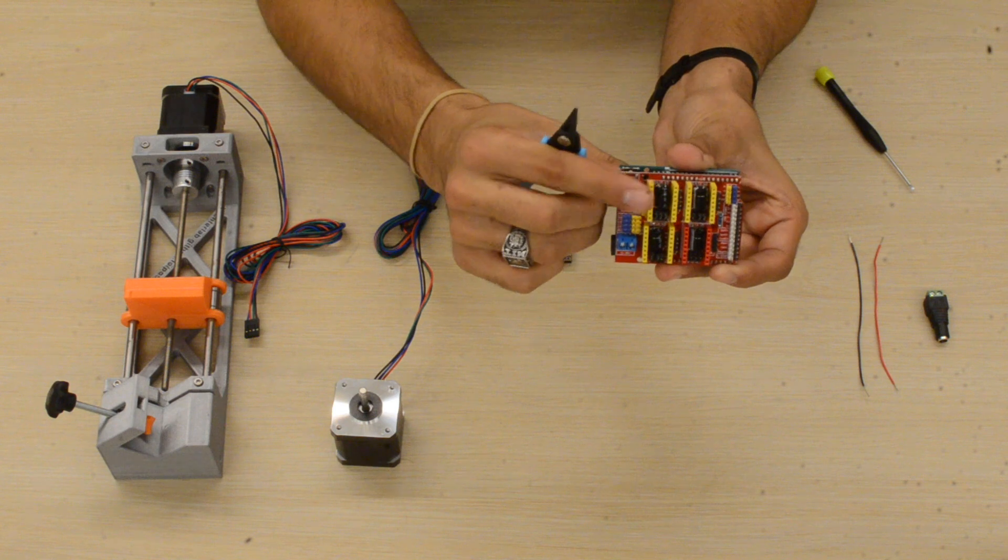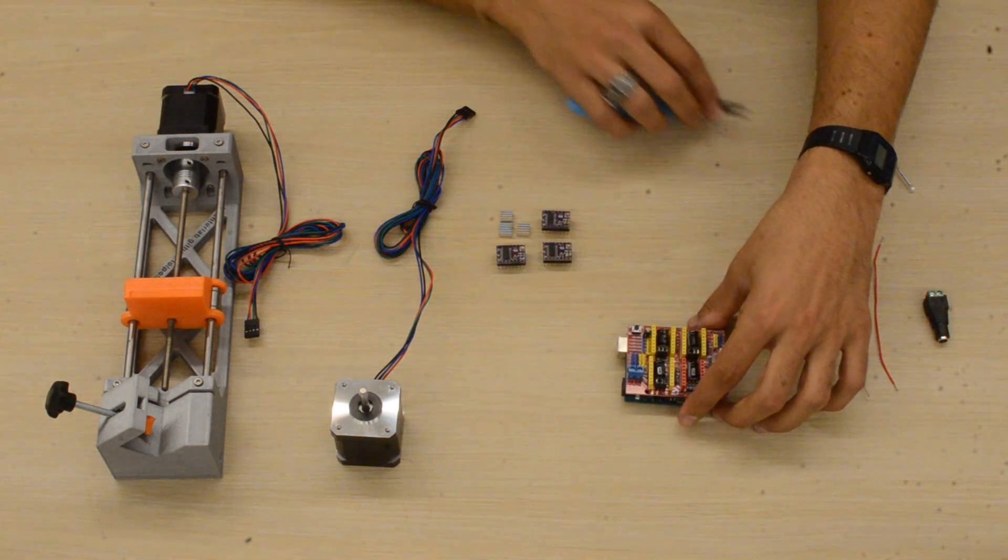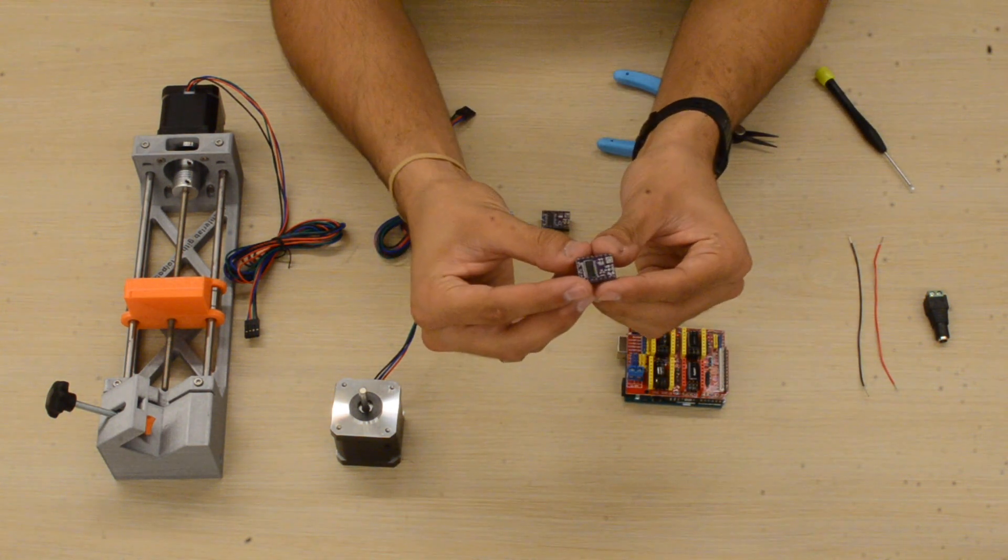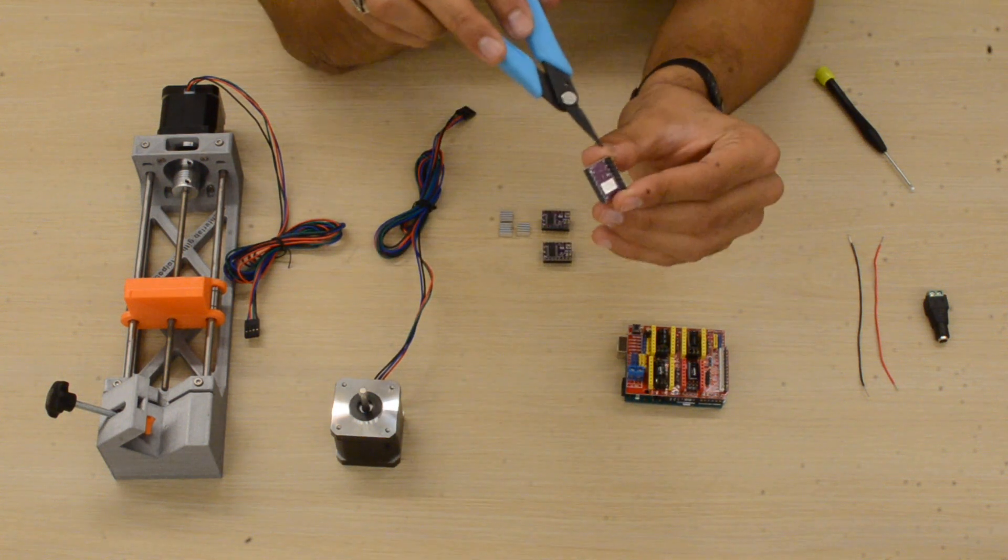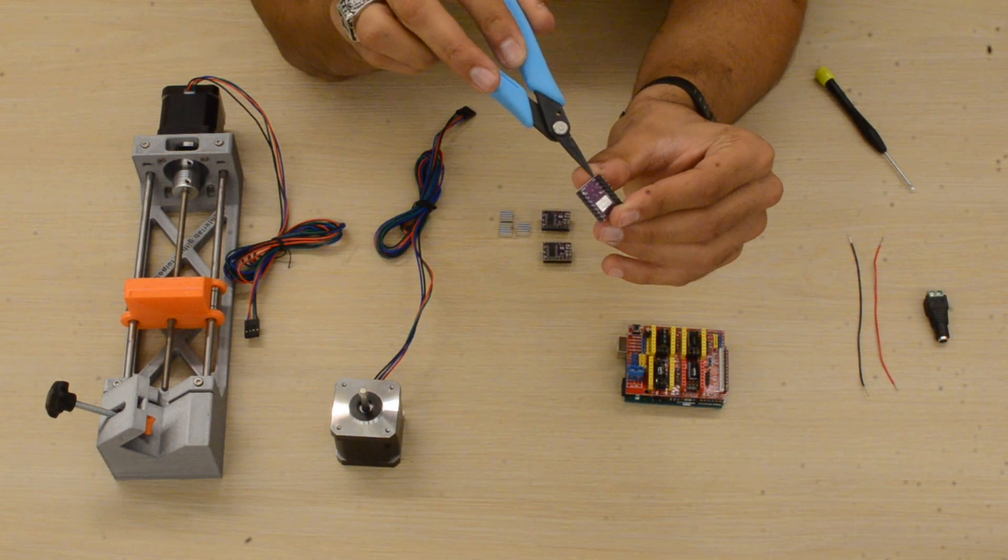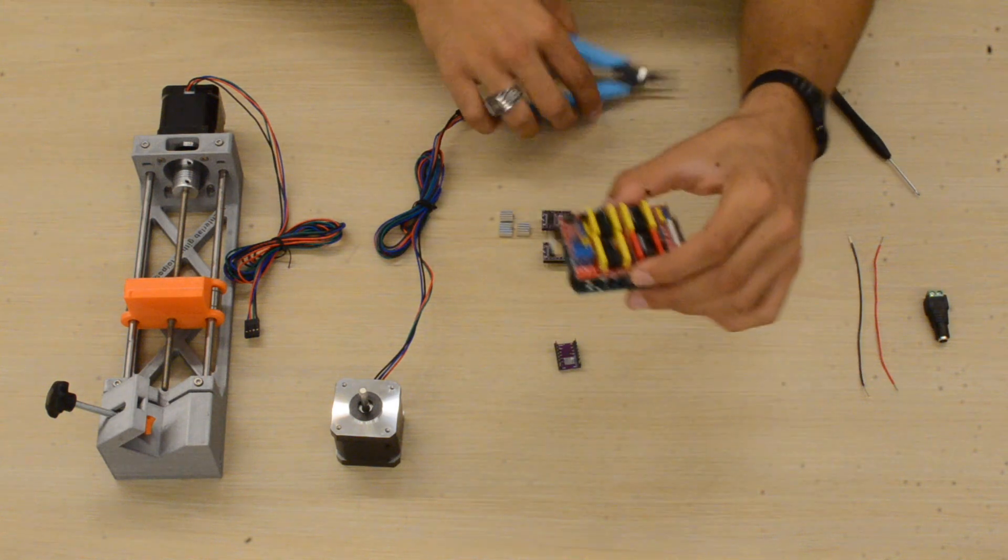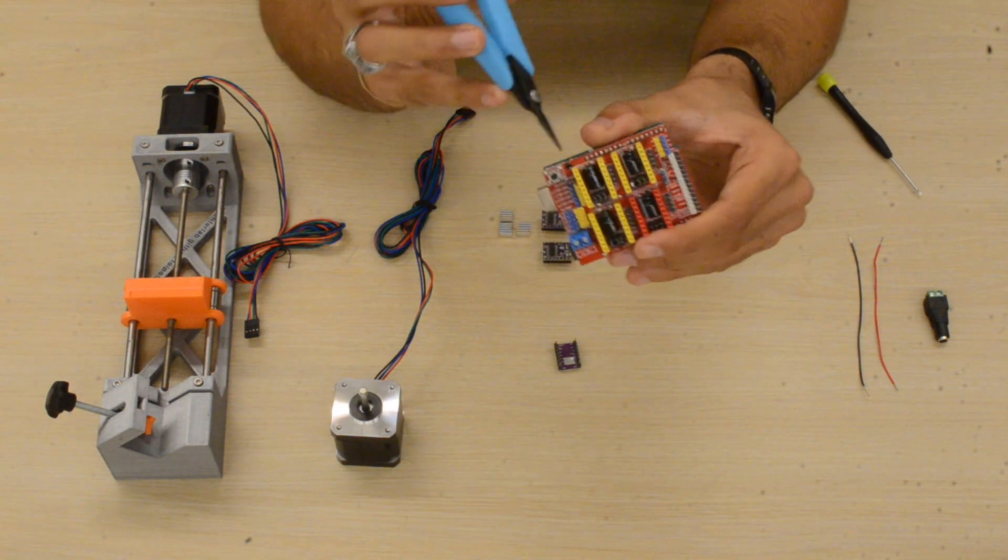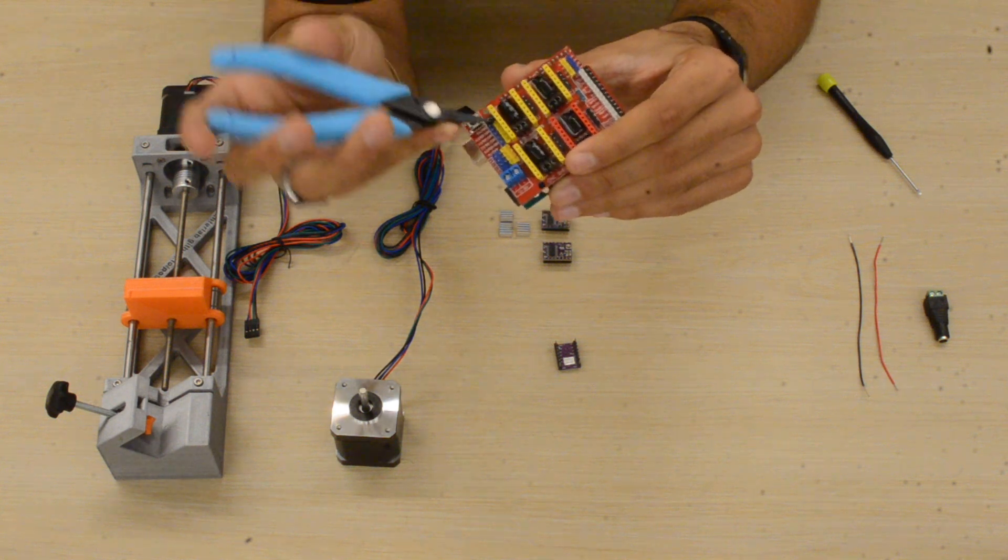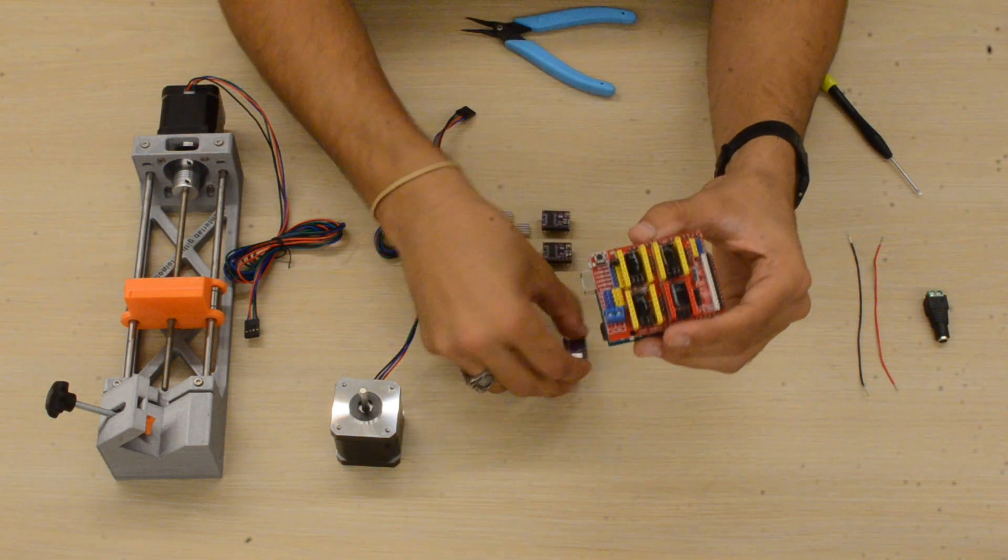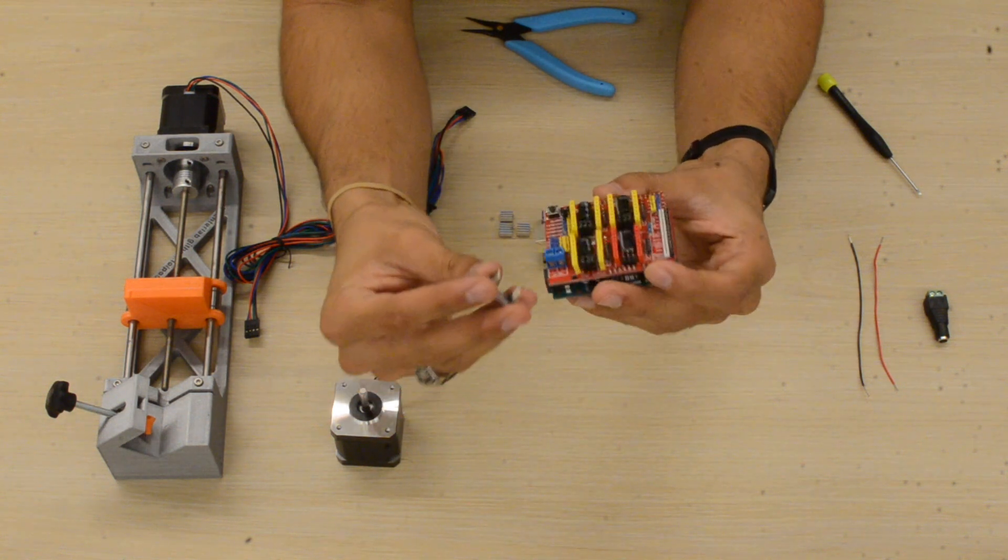Next, we'll take our Pololu stepper motor drivers and place them on the CNC motor shield. It's very important that the enable EN label aligns with the EN on the CNC motor shield—otherwise it won't be pretty; smoke will start coming out. The ENs should correspond on the board. Take a look at your driver, which is the purple bit, and your shield, and make sure that the labels align when you plug them in.